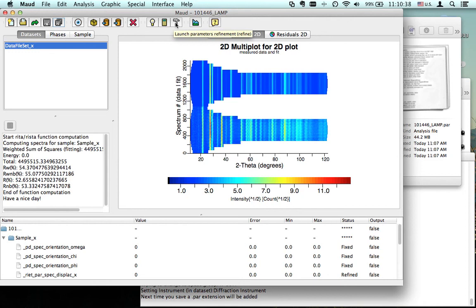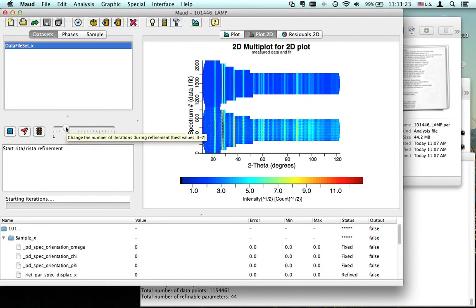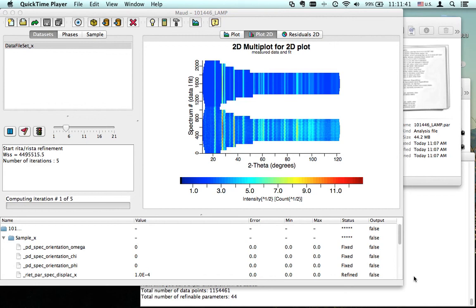Okay, let's go. So we launch, and if it's taking too much time, I will just stop the screen recording so it will run quicker, and then resume the screen recording when it has nearly finished the iterations. Okay, let's start, and I think it will take quite longer. Well, that's only what I will set when the number of iterations appears. I want to move this set over here. Now it's appearing. Oh, 5 iterations. Okay, let's leave 5 iterations. Now I will just stop the recording, or put it in pause and resume later.